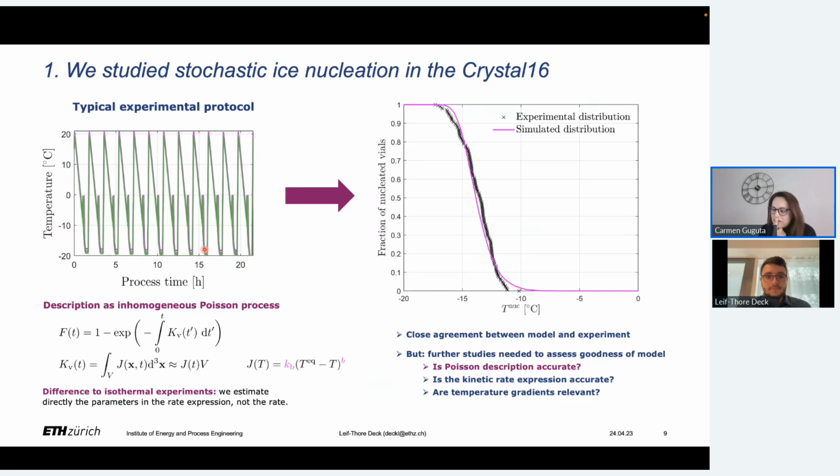And actually the accuracy depends on how accurate you want the data and how problematic or less problematic, let's say, is the system, the compound that you are working with. In some cases, even 20 degrees per minute was quite good enough for just getting an impression. In slightly more complicated cases, the 5 degrees per minute was ideal for the cooling rate.